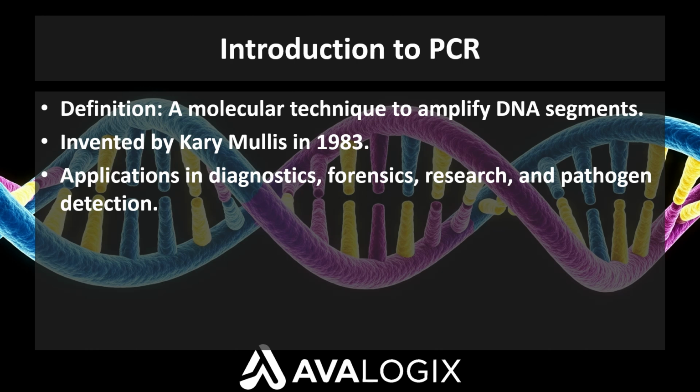Polymerase chain reaction was developed by Dr. Kary Mullis in 1983. His revolutionary idea allowed scientists to amplify specific DNA sequences rapidly, easily, and with high specificity. So significant was this innovation that Mullis received the Nobel Prize in Chemistry in 1993.